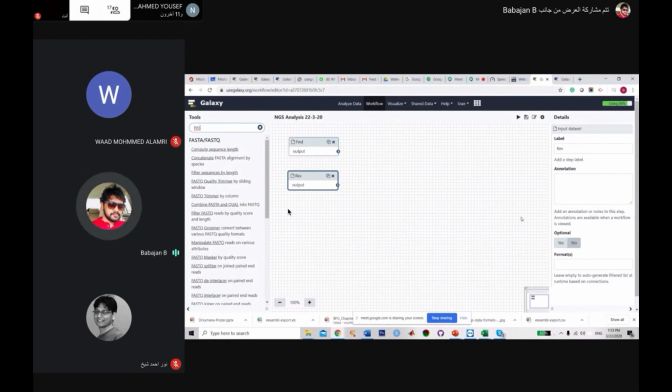Okay, next thing, as you told me, we need to understand the FastQ. We need to check the quality of the sequence. Let me charge my PC.